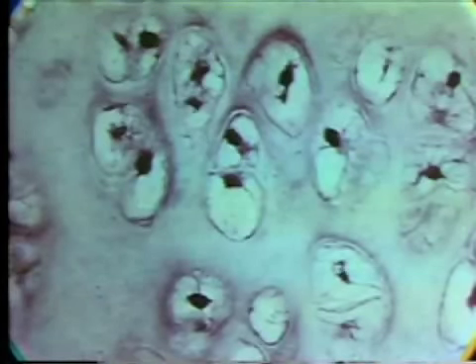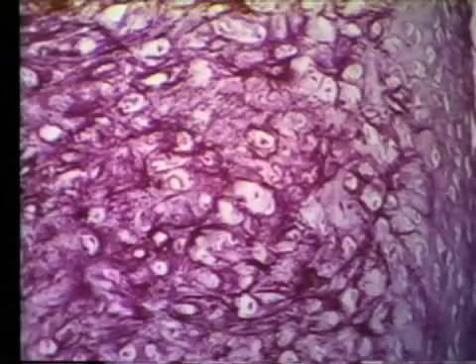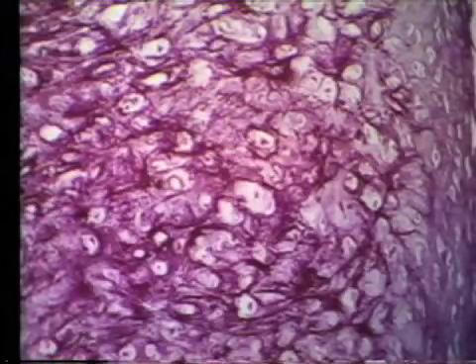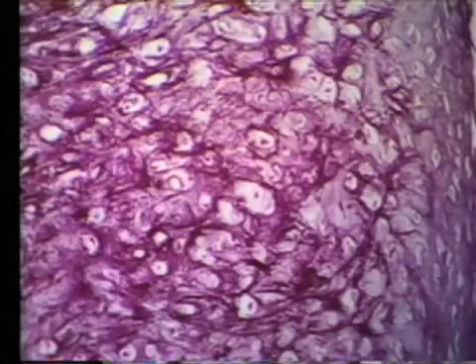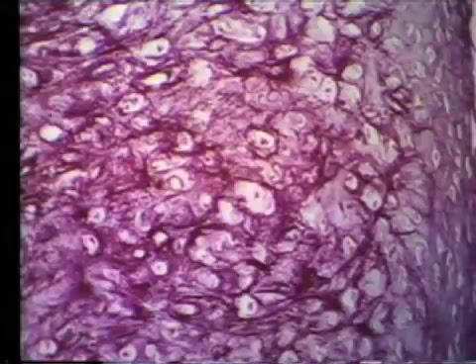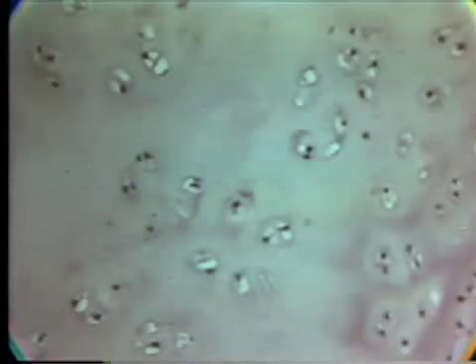What name is given to these groups of cells? Number 4, what type of cartilage is this? Number 5, what type of cartilage is this?